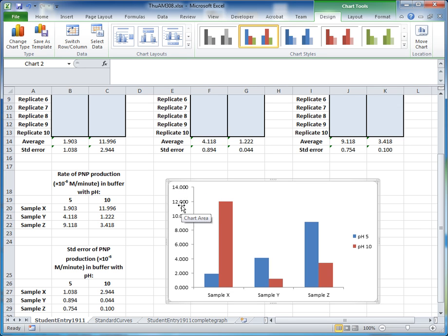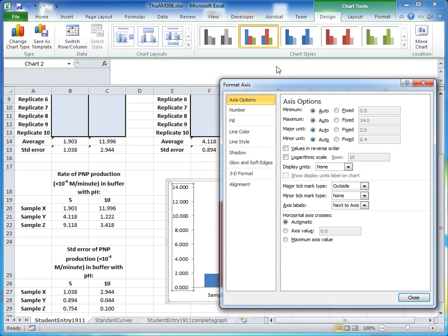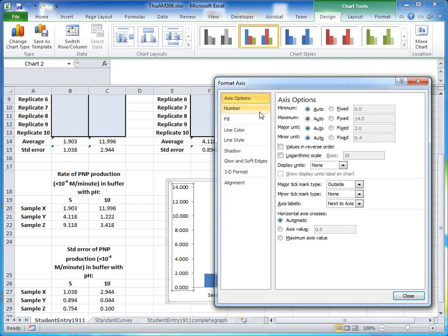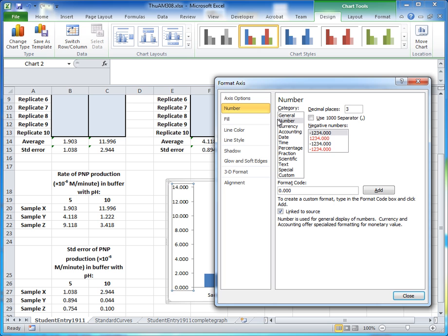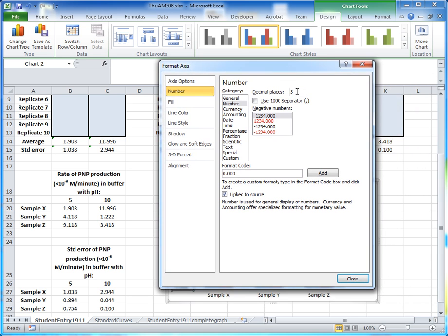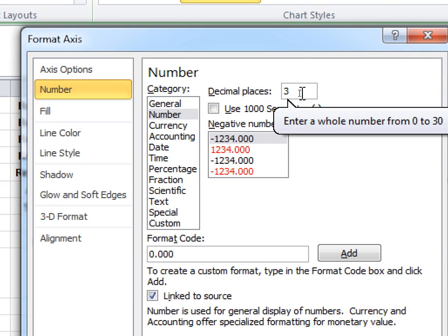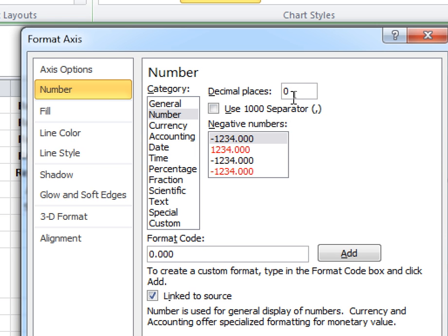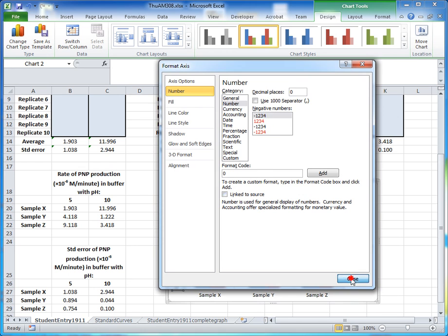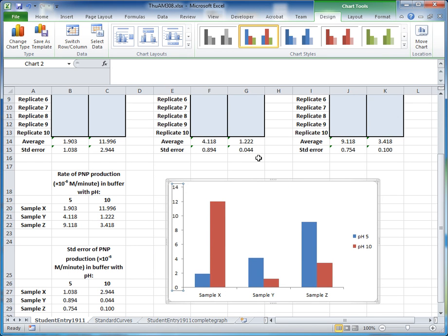The number of decimal places on the y-axis is too great. To edit the vertical axis, click on it and double-click to open the Format Axis dialog box. Under the Number option, you can see it's plotting three decimal places. Since our numbers range from 0 to 14, change the decimal places from 3 to 0 and click Close. This removes the unnecessary decimal points.